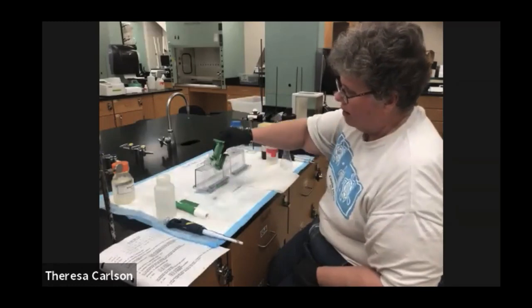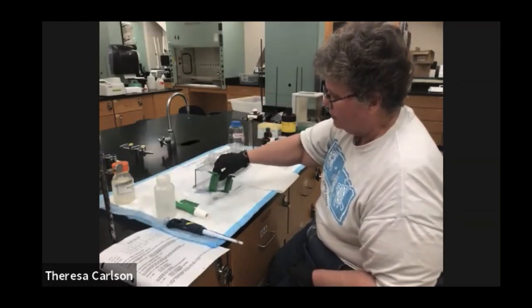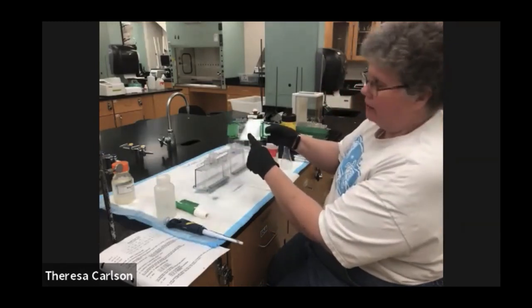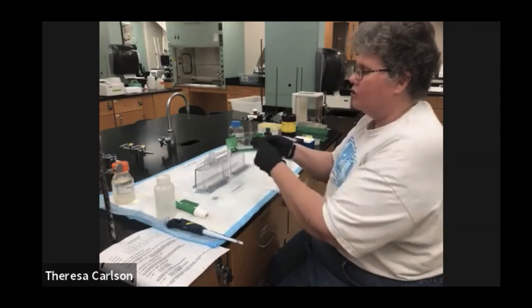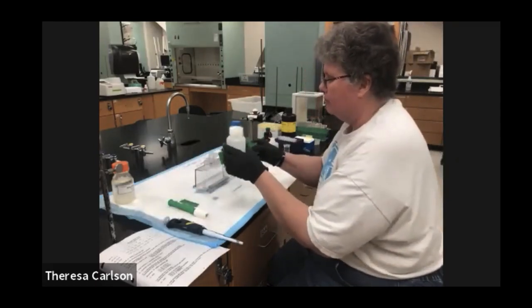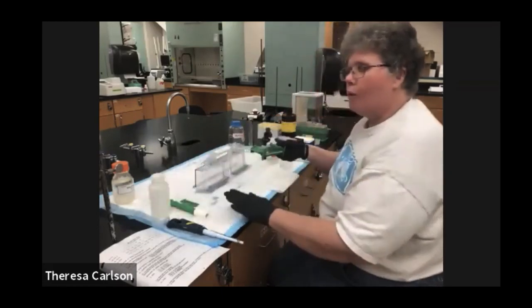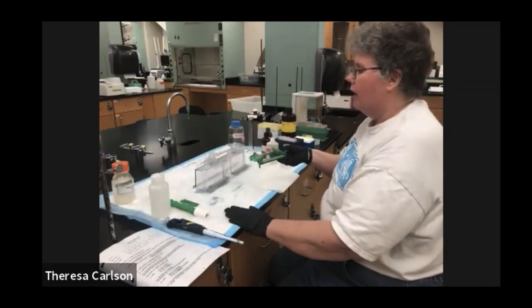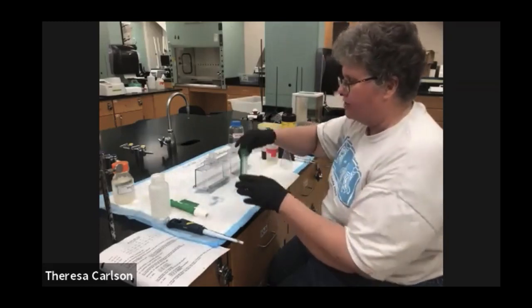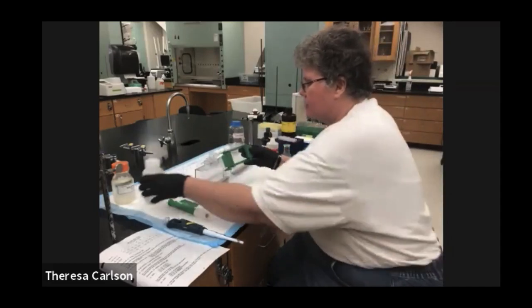We can pour off the T-amyl alcohol from the top, and we have our gel material right in here. You want to rinse off the top of the gel to get rid of any T-amyl alcohol. So just a little bit of water in here pouring onto the bench cover. Always working with a bench cover because you don't want to get acrylamide or anything else on the bench, and it just makes it a lot easier if you can just pour things right out. So a couple rinses with water.